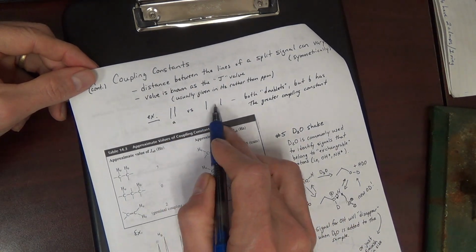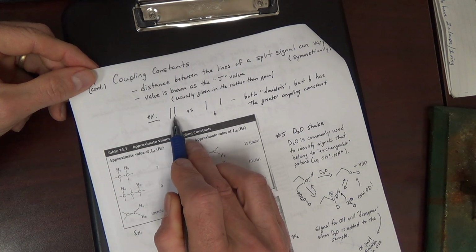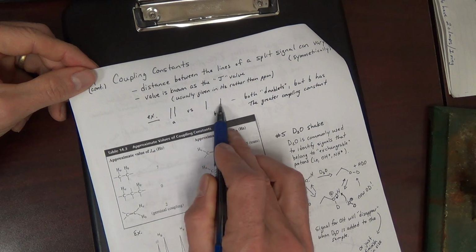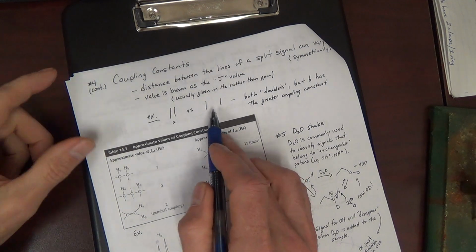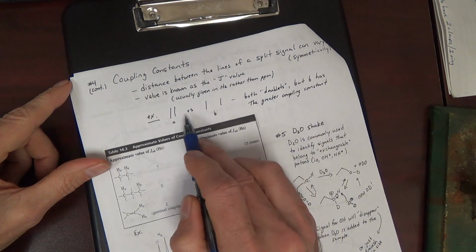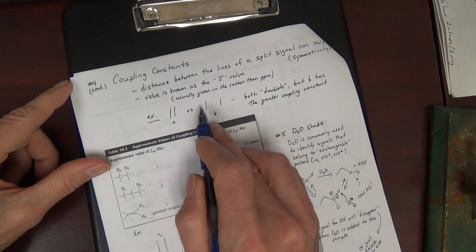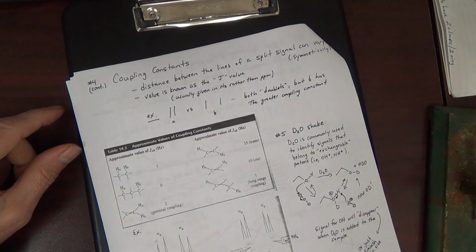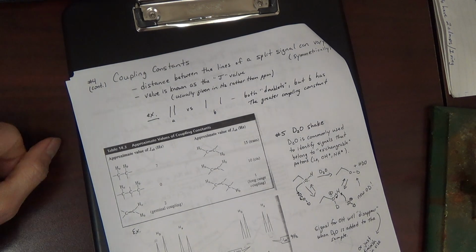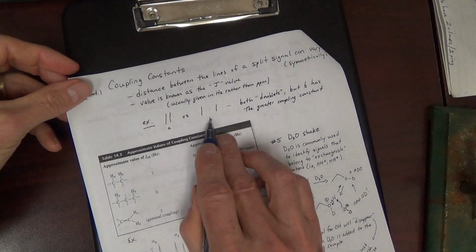For example, 2 doublets shown here. The 2 lines of a doublet can be relatively close together, or the 2 lines of a doublet can be further apart. We say that in this A doublet, B doublet, the B doublet has a greater coupling constant. Greater splitting, but typically we call it the coupling constant, or a greater J value for the B doublet.